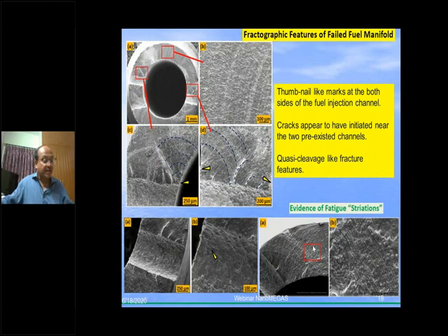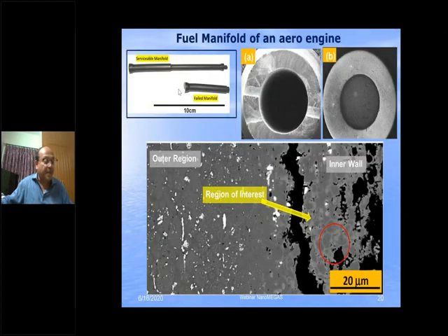We find out that these cracks appear. You can see the crack starts appearing. So basically this particular area we actually have to take out. So what happened? We slowly magnify, go to an FESEM, then identify a region.